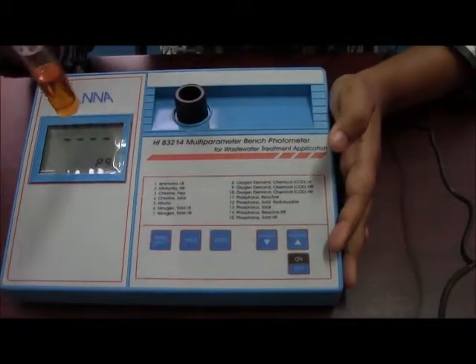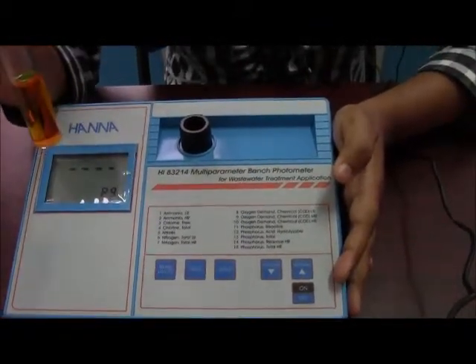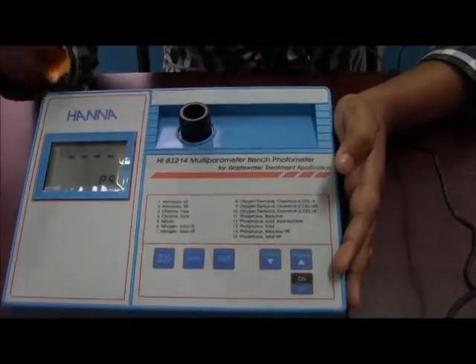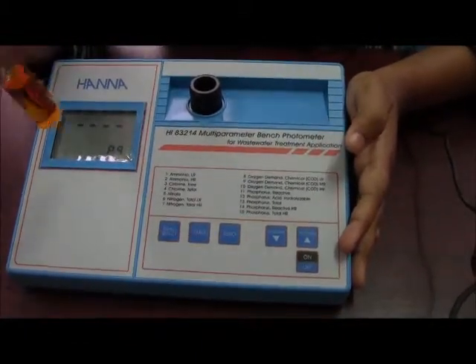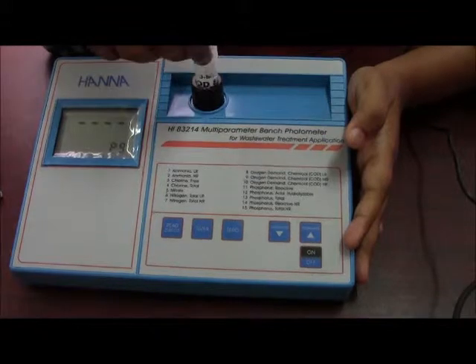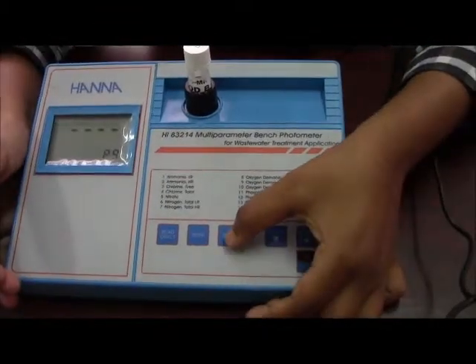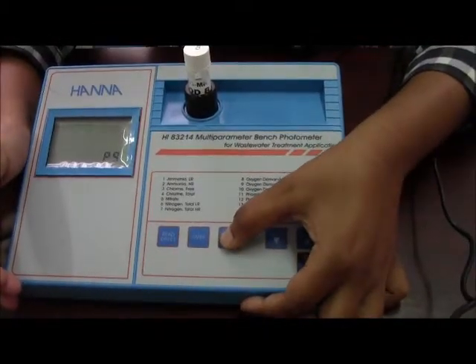This is the blank sample in which 2 ml of distilled water is there and it has been digested at 150 degrees Celsius for 2 hours. We would zero it first.